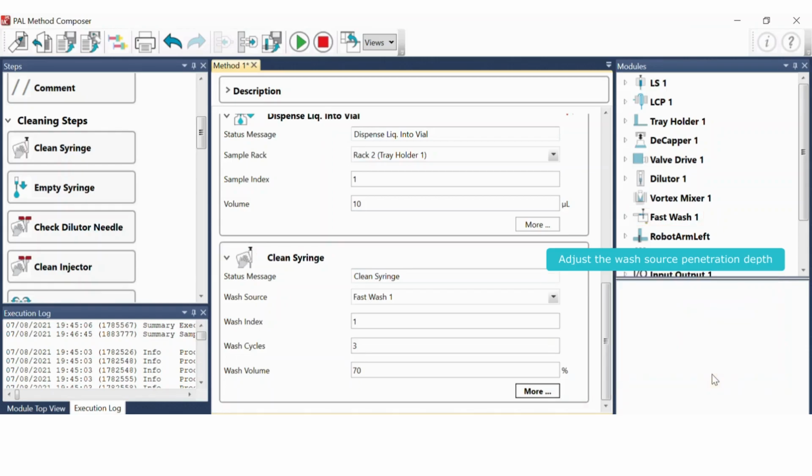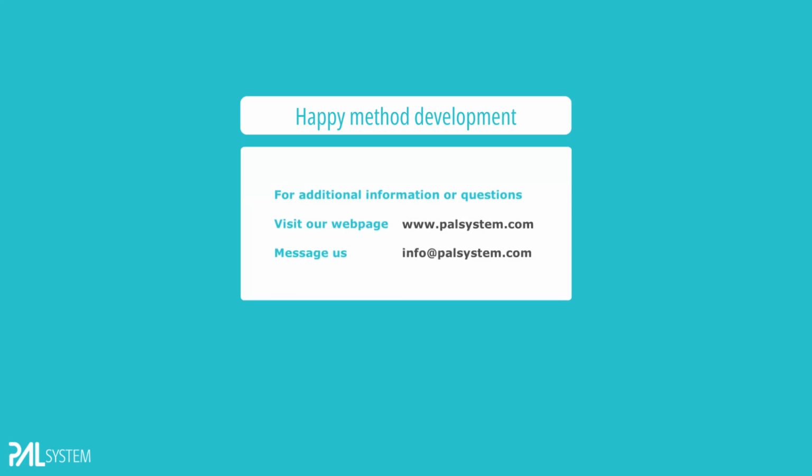Congratulations, you just learned the basics to build and execute methods on your PAL system. For more information, visit our webpage, the Content Hub, or message us directly.